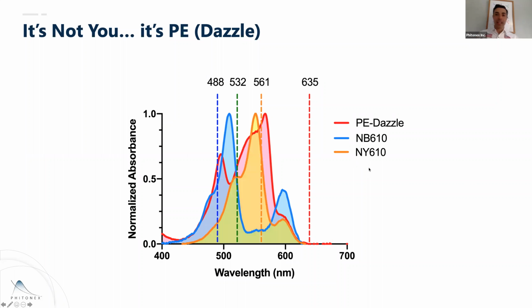Because what if we just excited the yellow off the yellow and the red off the red? And what if we design fluorophores for the entire spectrum, right? Not just do an organic chemistry project to say, okay, well, we've got that dye, and it bleeds in a violet, but we'll just accept it. And that's the way we've thought about this. In fact, for what it's worth, we'll throw out labels that have too much spread or are cross-excited above a certain threshold, because we are designing for the whole spectrum, right?